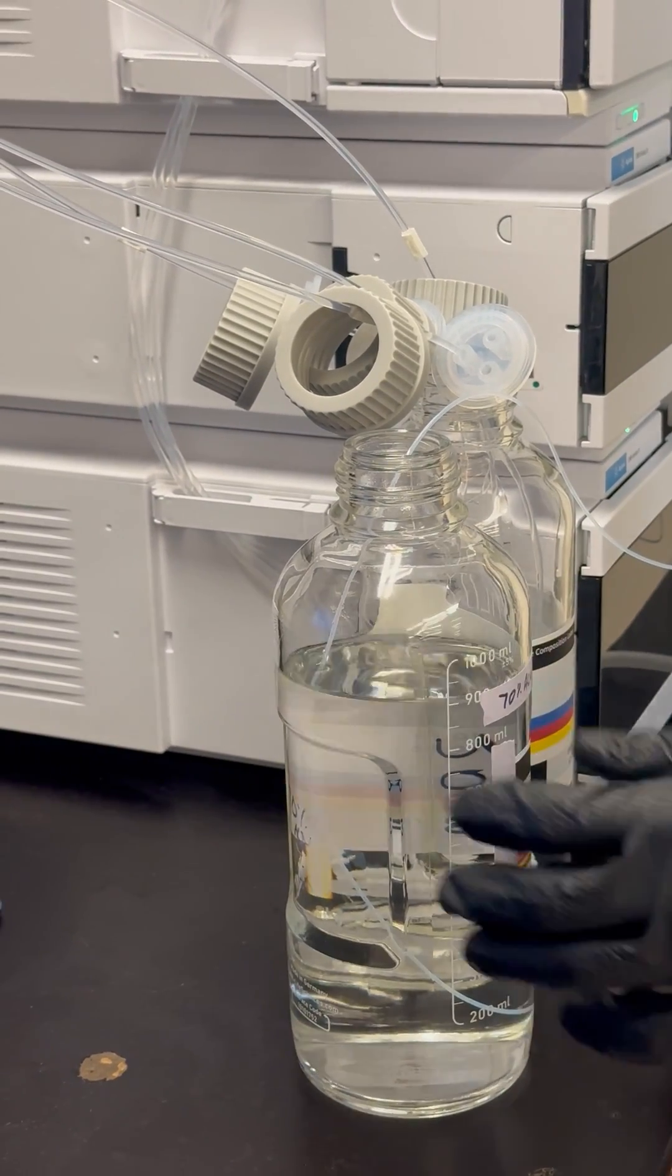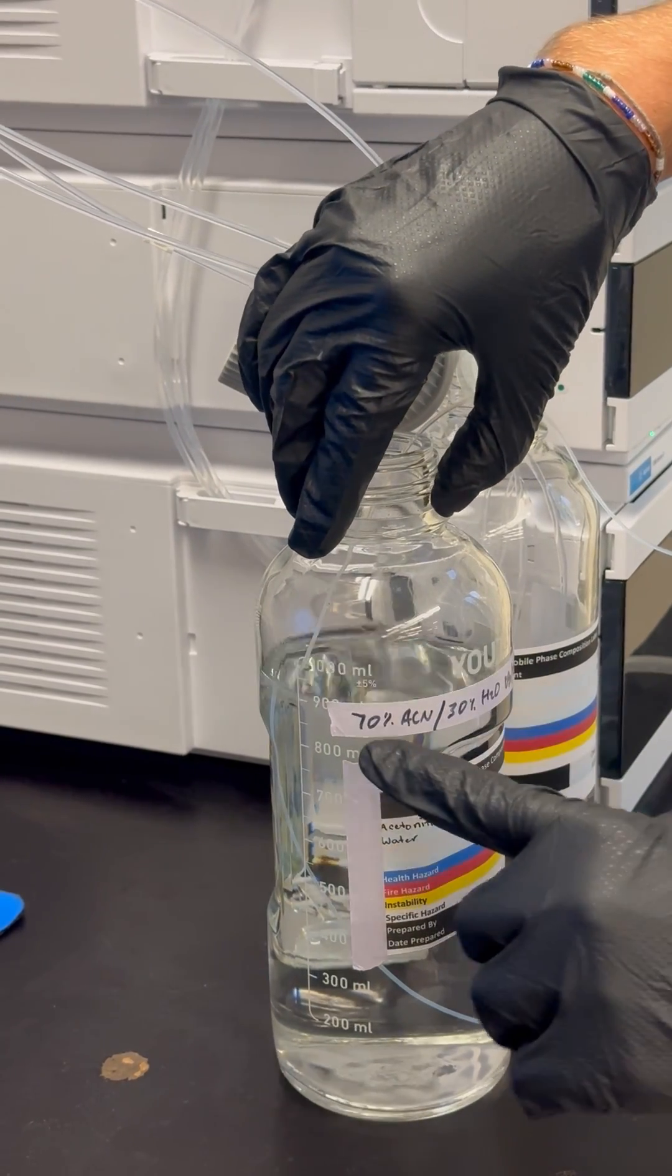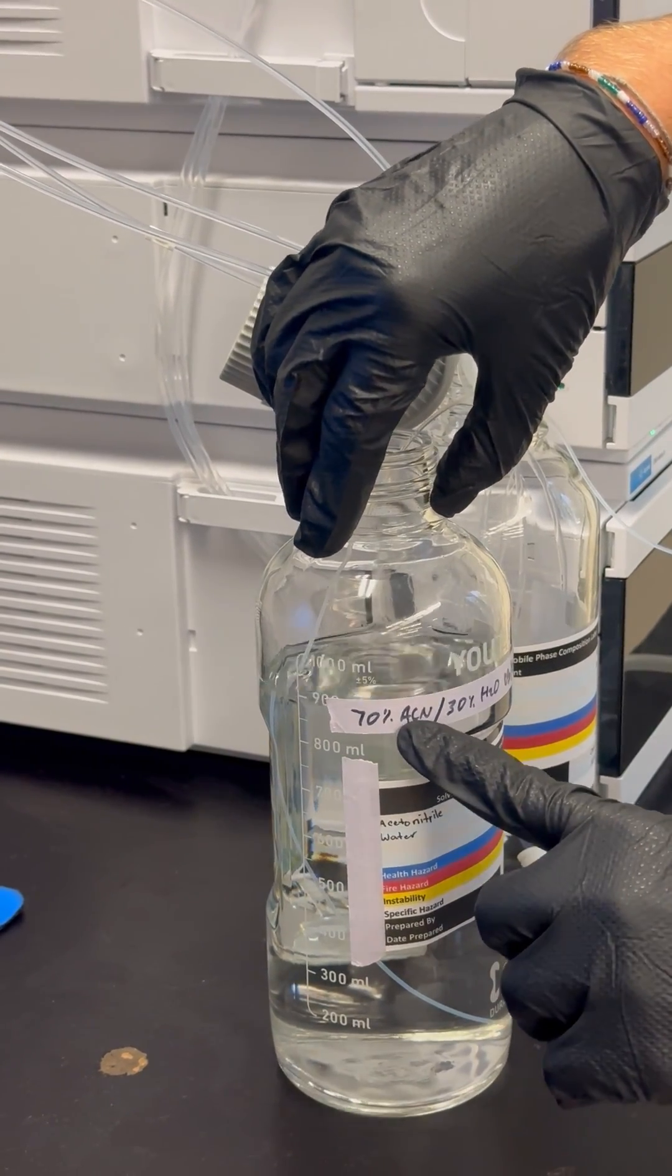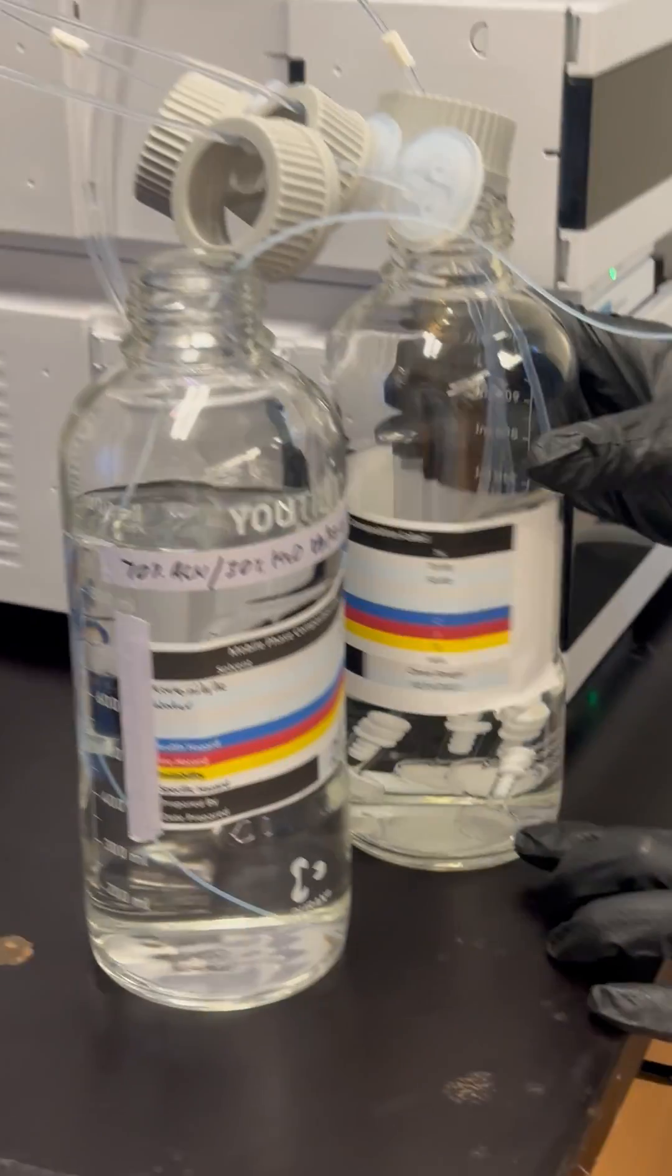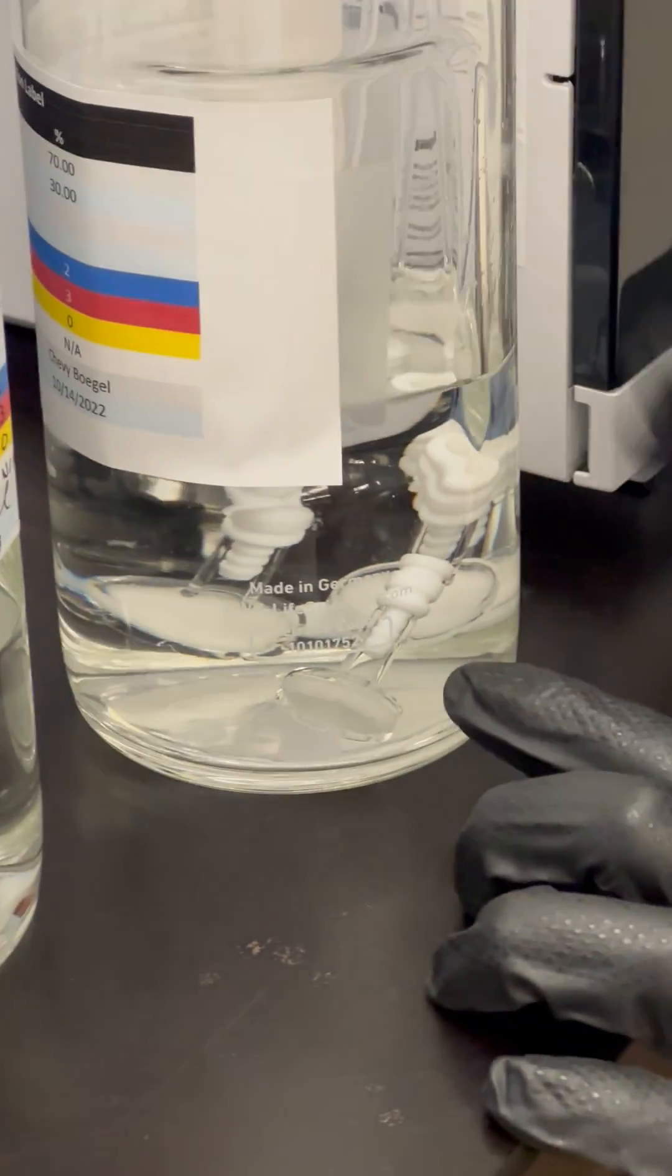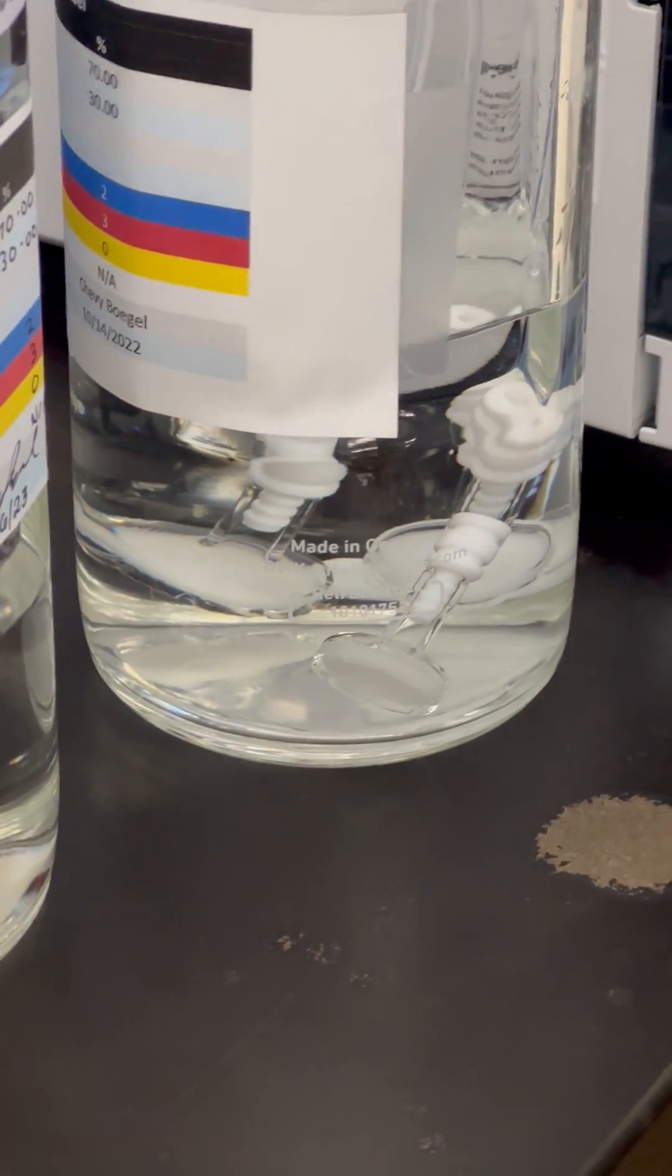So we're going to prepare a beaker of 100% organic because we have organic and water. Whatever our organic is, we're going to use that to rinse our inlet filters. These are fiberglass filters, and we're going to wash those fiberglass filters with our pure acetonitrile before we introduce it to our new mobile phase bottle.